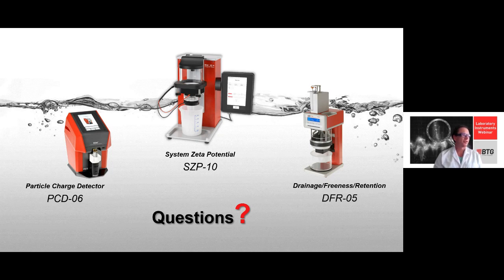Handling such aggressive chemicals, needless to say, but I'd love to mention this: take care. So do it in a ventilated environment, and wear all protection equipment that you have in place.